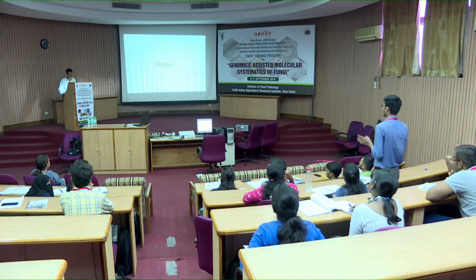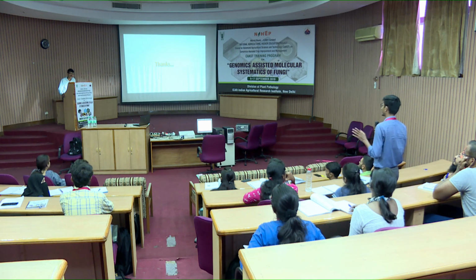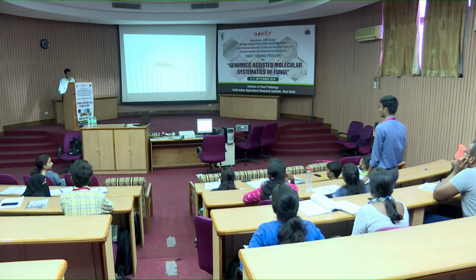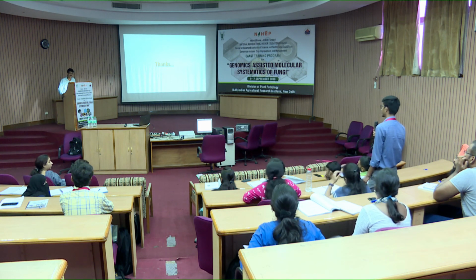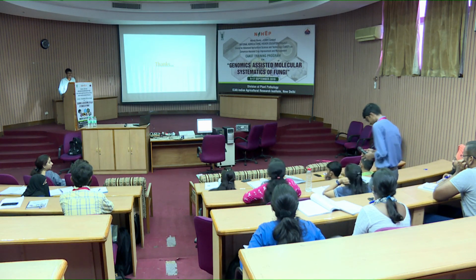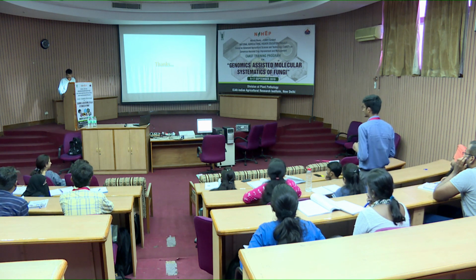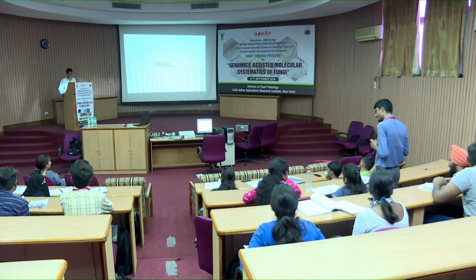No, sir. I'm asking whether the PCR product obtained from real-time PCR, we can go for sequencing or not. Yes, we can. PCR product sequencing is one of the most sought after tools now. Every lab is doing that. There are no problems. And if you are very tech savvy, you can clone it and sequence it. Cloning is not a big deal. I think that is also integrated in this training. You go for pGEM-T cloning or any cloning which is doable in your lab.